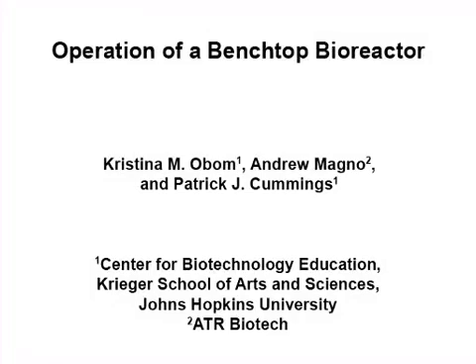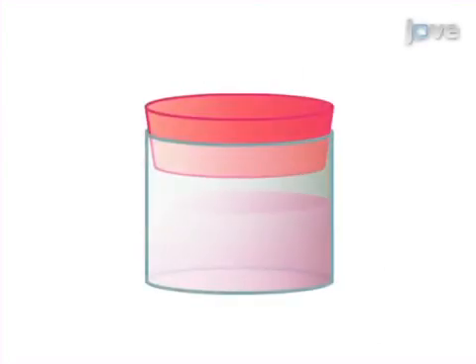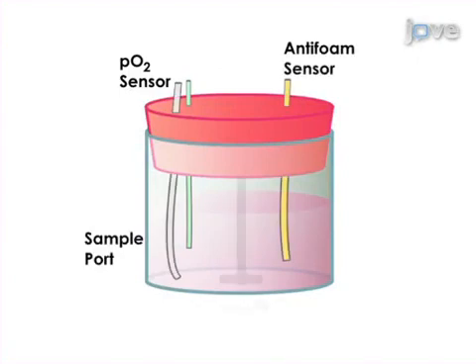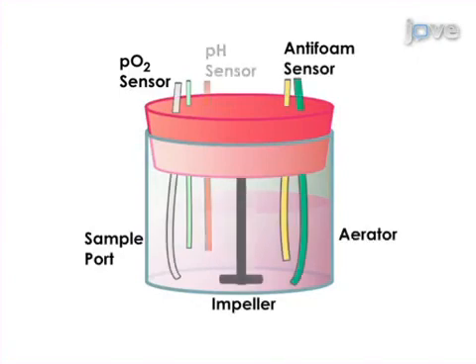The overall goal of this procedure is to set up a bioreactor that will provide a controlled environment for large-scale growth of bioengineered cells. This is accomplished by first assembling the vessel, calibrating the pH probe, and autoclaving the assembled vessel.